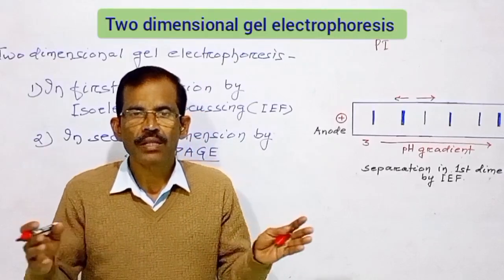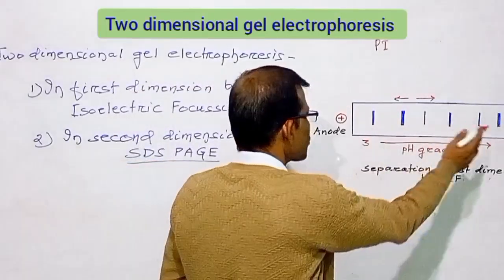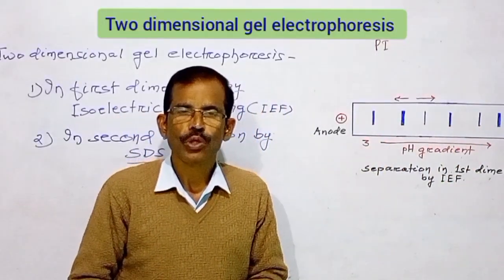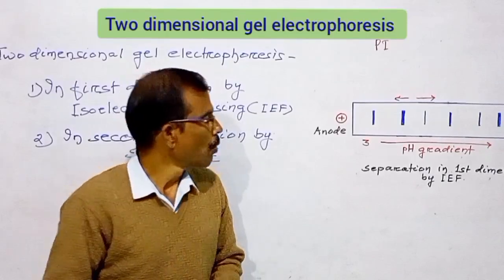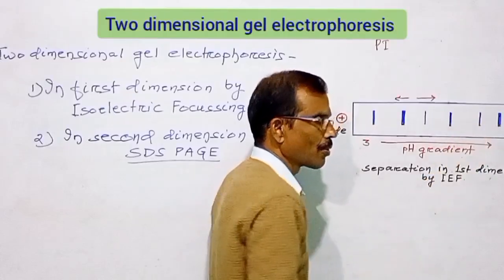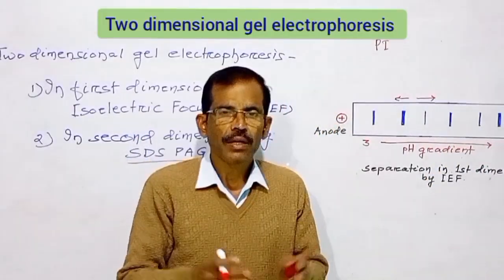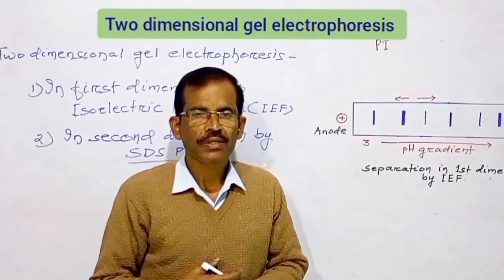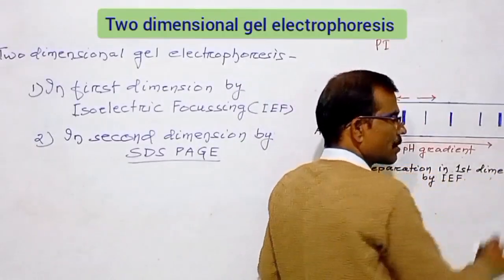In conventional gel electrophoresis, the pH between cathode and anode remains constant. So during one-dimensional gel electrophoresis, when biomolecules migrate from anode to cathode, their net charge remains the same. By contrast, in isoelectric focusing, proteins are forced to move through a pH gradient.